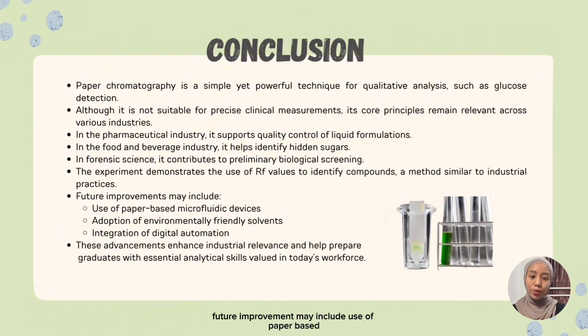Future improvements may include use of paper-based microfluidic devices, adoption of environmentally friendly solvents, and third, integration of digital automation. Advancements enhance industrial relevance and help prepare graduates with essential analytical skills valued in today's workforce.